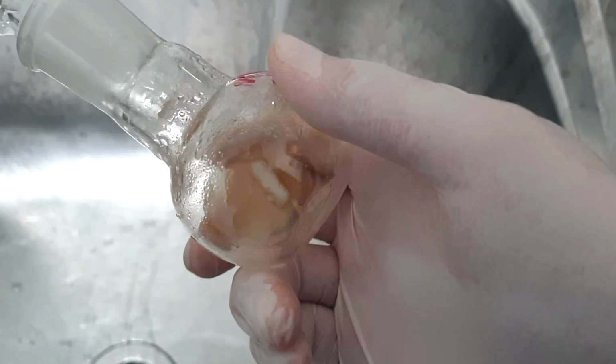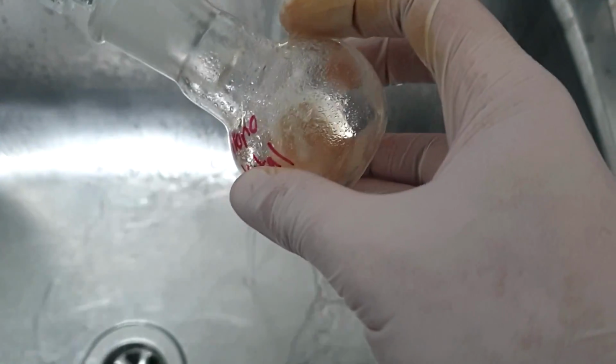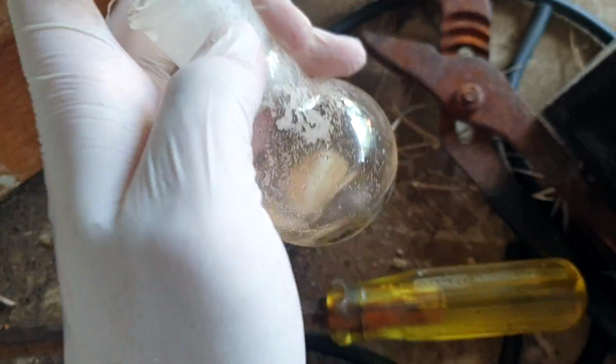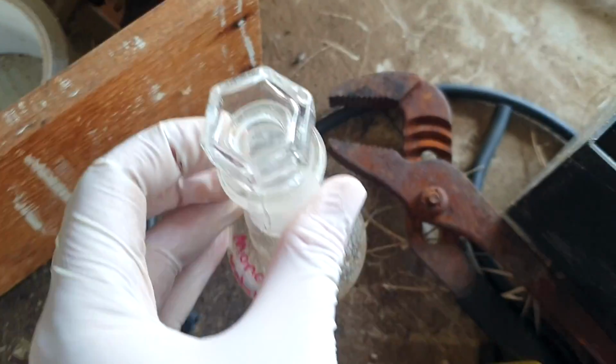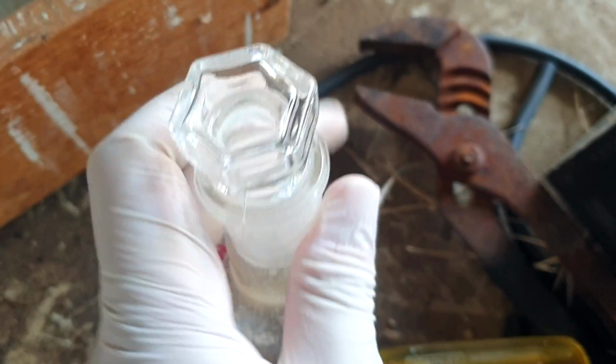Can't believe I seized these joints like a fucking amateur. Yeah, don't need to grease anything. Just take the thing off the heat and seal it up. Everything will be fine. Fucking amateur. Yeah, big pair of pliers and gently trying to spin it. And when I say gently, I mean excessive amounts of force. But hey, it didn't crack the vial. So I think I'm lucky to get away with it, but that could have gone badly.